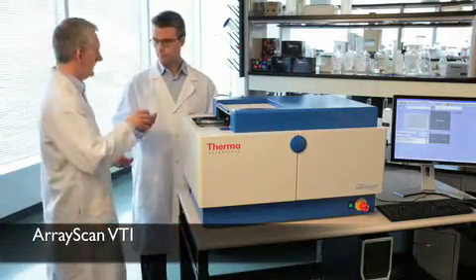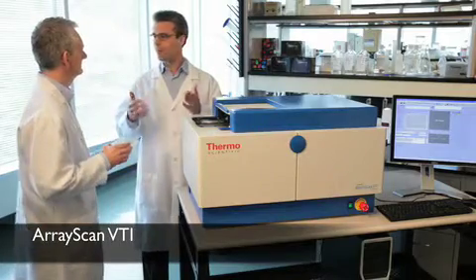Can you run this plate today? Sure, I'll run it right now. Great, actually, you know what, I can't wait around. Can I come back after lunch?